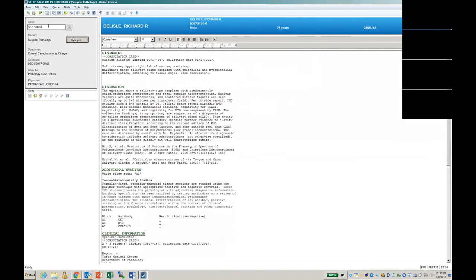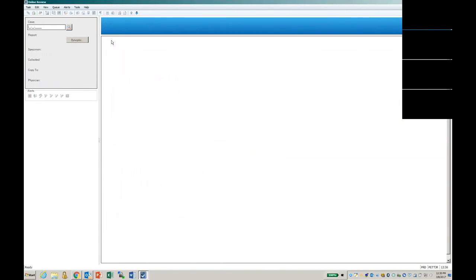Is there a tumor registry box clickable as part of this, where you can flag a case for the tumor registry? Well, you really wouldn't have to. We could build an interface to your tumor registry. In fact, I'm not sure if you're aware of this, but we were the first vendor to submit electronic data to the California Cancer Registry.